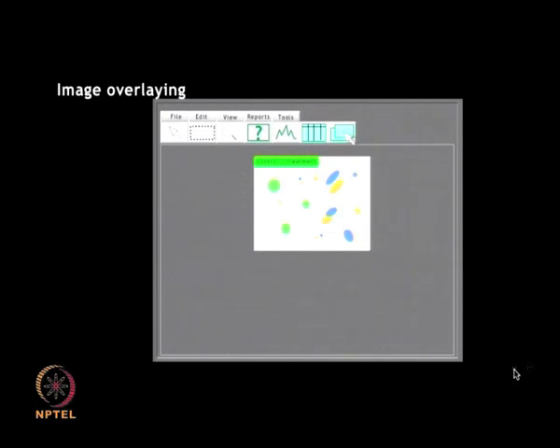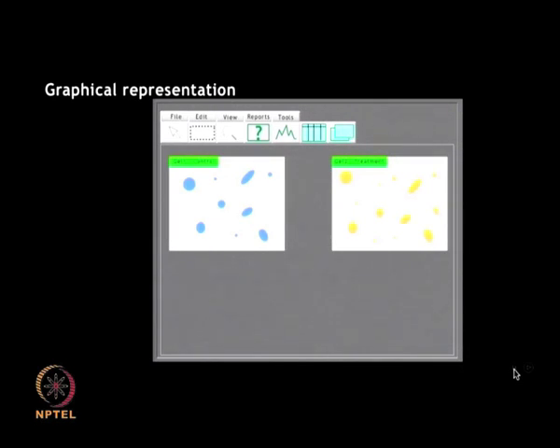This is extremely helpful while comparing large clinical samples of controls and treatments, so that you can obtain a clear indication of the proteins which are differentially expressed.